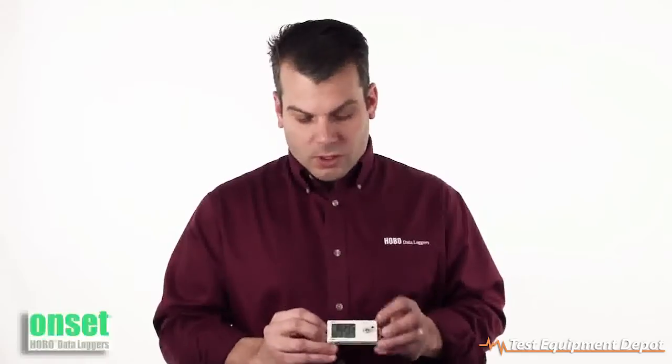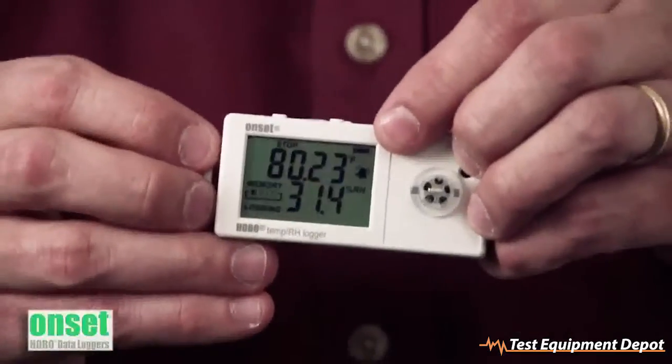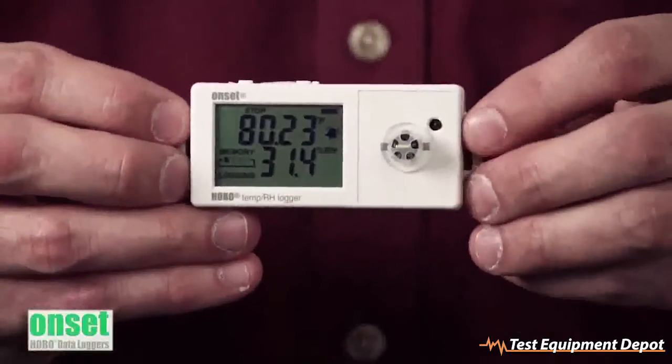We also have the ability to show visual alarms, as you can see by the little bell icon on here, indicating that something has gone outside of range.